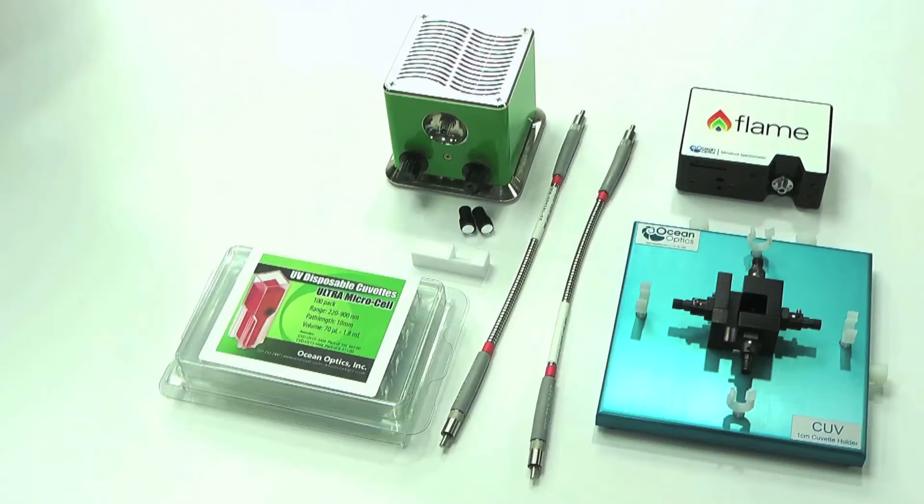The equipment used in this setup is as follows: the Flame spectrometer configured for UV-VIS, and two 600 micron UV-VIS patch cords with SMA connectors.